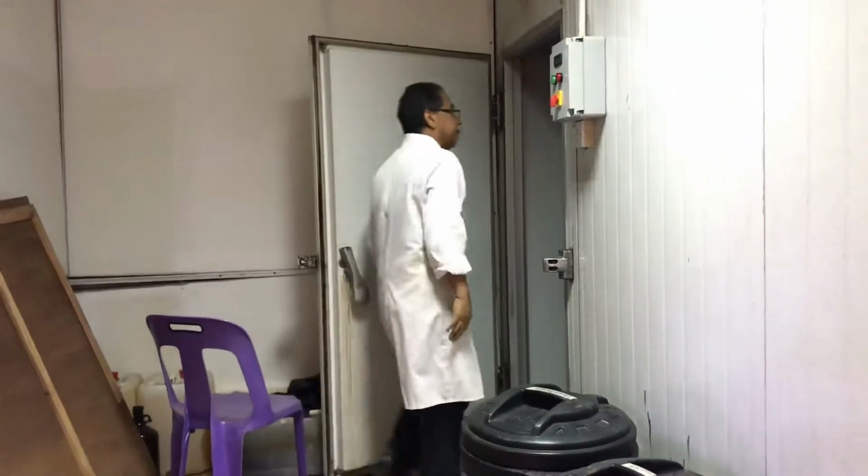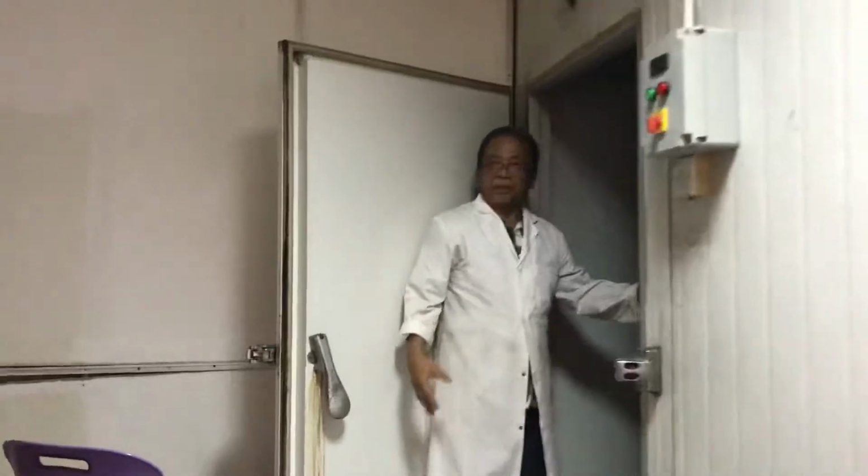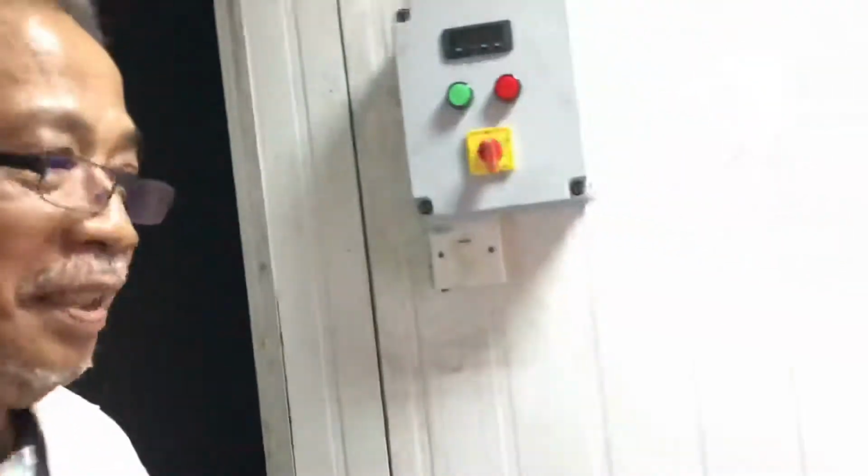It's just like a refrigerator, a bit. Sorry, the light is not working, so it's okay, we skip this.